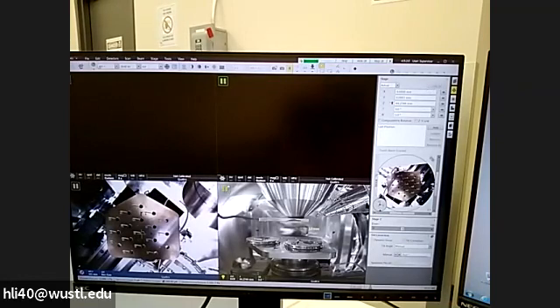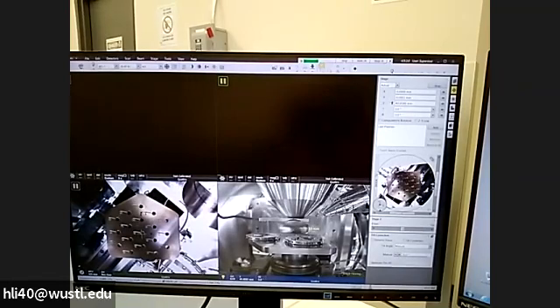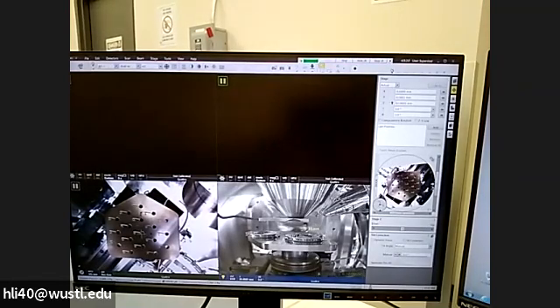Again, make sure this camera is alive, so we click this pause button off. We can drive up a little bit more. For example, now I can drive to 51. If I want to stop it, it's okay. So now it's very close to this 10 millimeter line. We can try more if we like. You can type another number, 52 there.